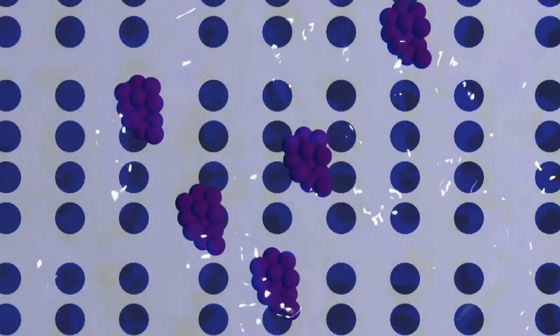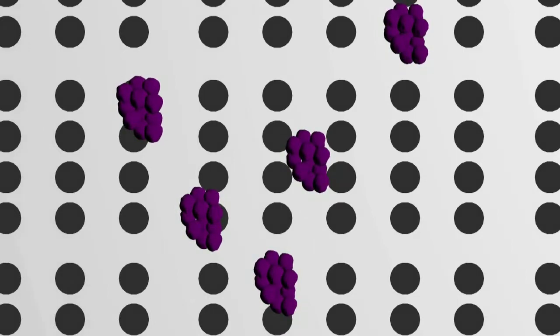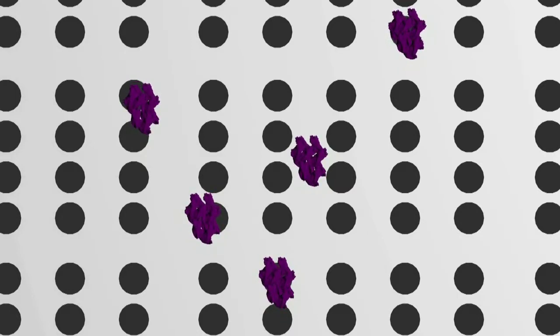The third problem with this test method is that there is no vacuum or pressure applied to the fabric to help the bacteria pass through it. Even the small amount of liquid applied by spraying will be of no help after it has quickly evaporated. With no mechanical help, the bacteria will not pass through the fabric and the BFE will be higher.